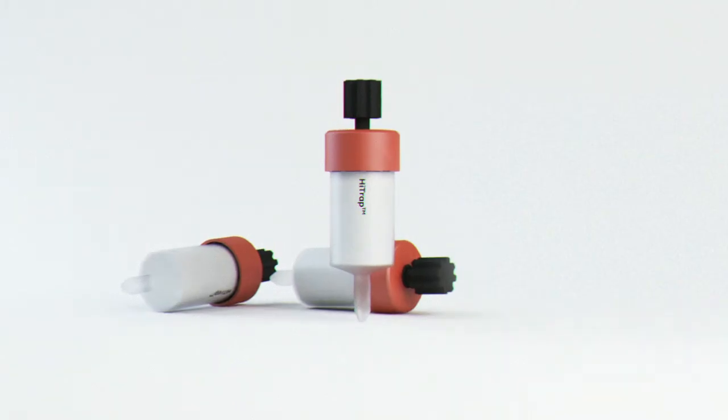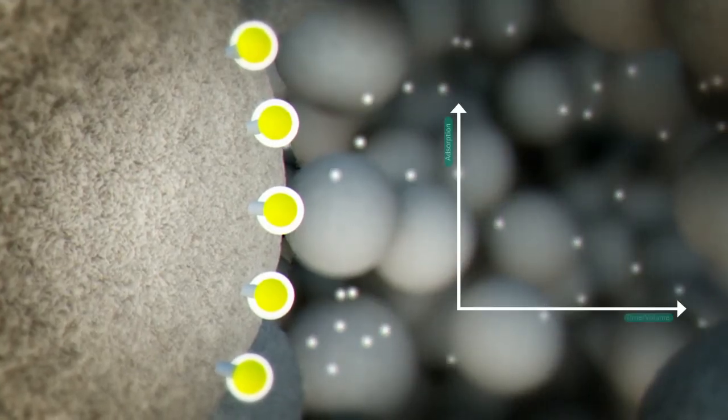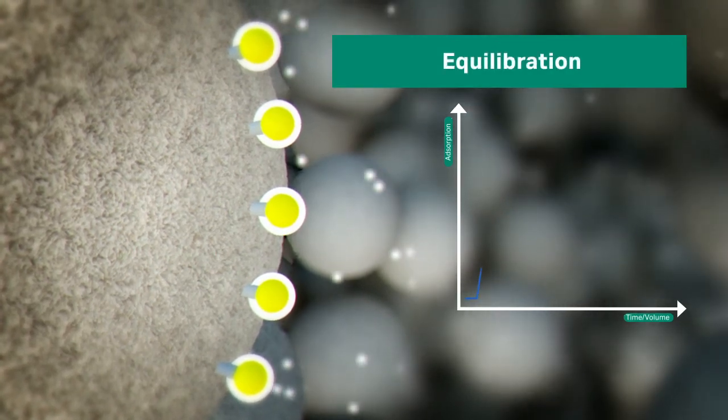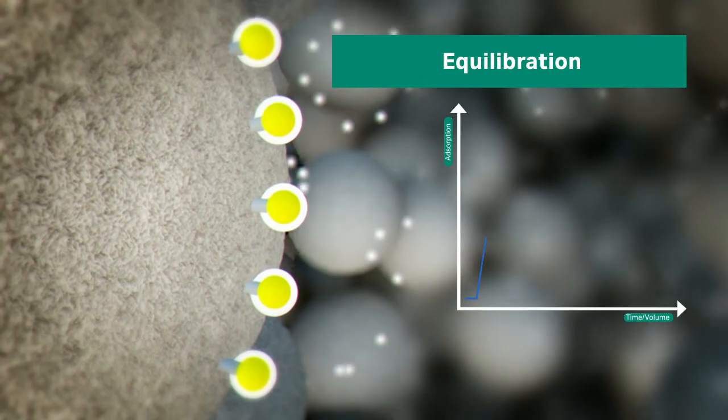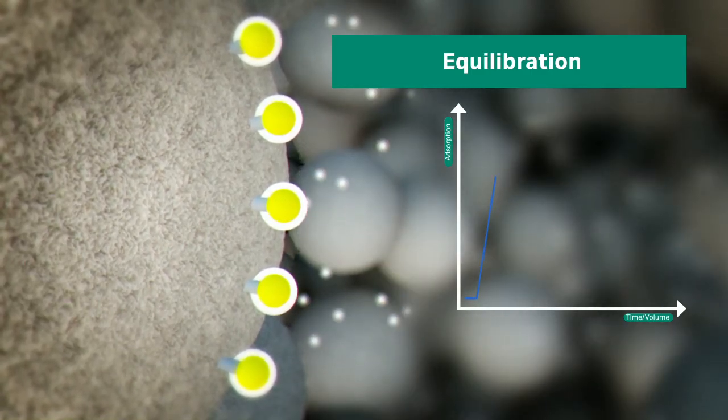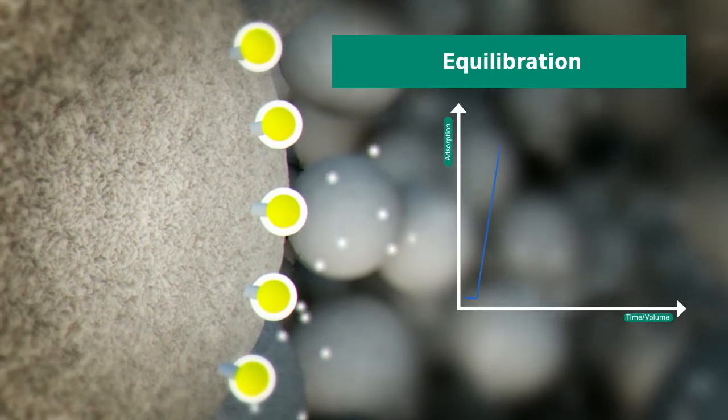The first step is the equilibration of the stationary phase to the desired start conditions. Equilibration is performed by adding salt to the mobile phase. The general equilibration buffer in this step is 50 millimolar sodium phosphate with 1 to 1.5 molar ammonium sulfate.